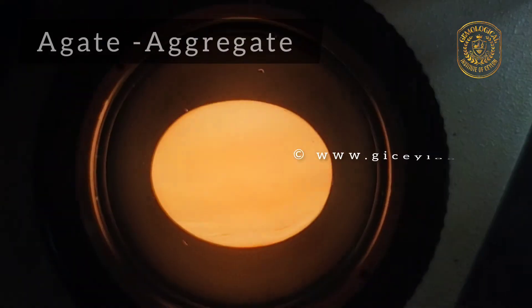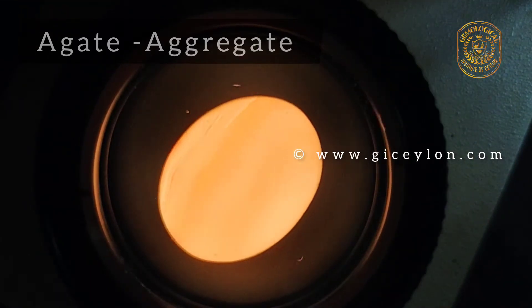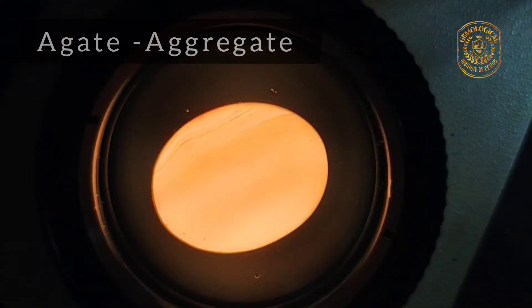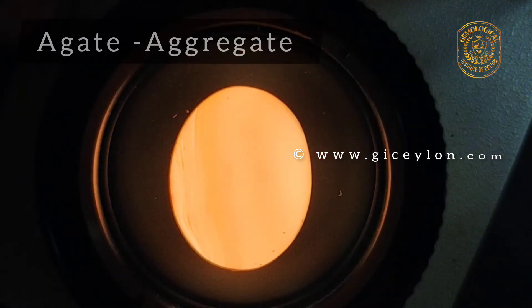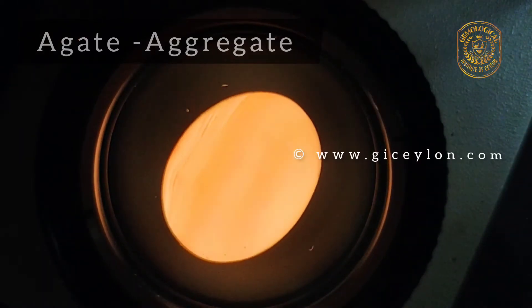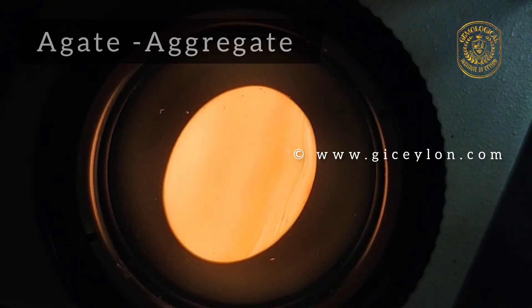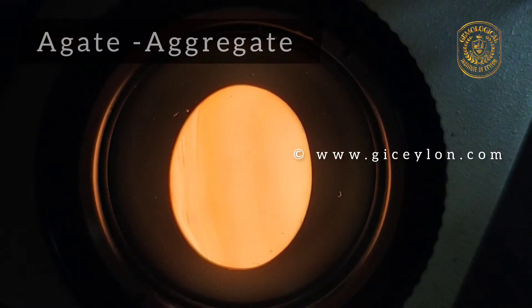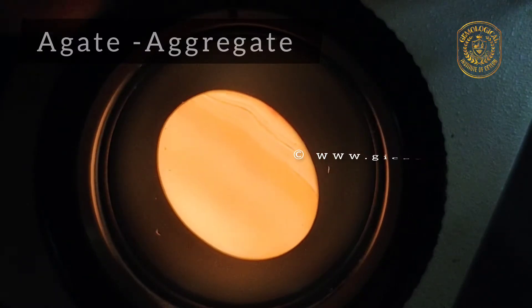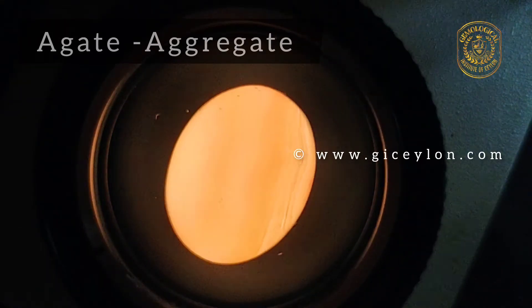Double refractive aggregates: in some transparent to translucent gemstones, during their 360-degree rotation on the polariscope, they will appear in a lighter shade throughout, and such gemstones are called double refractive aggregates. This is because such materials consist of randomly oriented small anisotropic crystals or crystal fibers, and some of these will always produce polarized rays the planes of which are parallel with those of the analyzer. Hence, at each position, light passes through the analyzer and appears as light. Microcrystalline examples: agate, chrysoprase. Polycrystalline examples: jadeite and nephrite. The same effect can sometimes be produced by materials that contain a series of thin plates formed by repeated twinning, called lamellae.